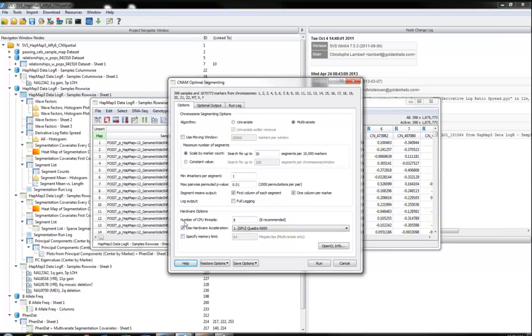Another thing to be aware of is that if you happen to have a GPU on your computer that is capable of running OpenCL code, it will really speed up the processing for you. On this particular machine, I have a mid-grade GPU that helps out. I've got another machine here in the office with a high-end NVIDIA GPU that really makes a big difference.